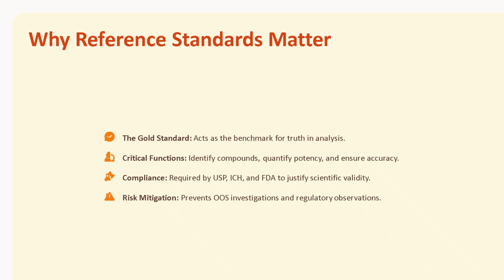More importantly, regulatory bodies like USP, ICH, and FDA expect proper justification for the standards we use. Choosing the wrong reference standard can lead to serious consequences, such as out-of-specification results, investigation, and even regulatory observations. So, reference standards are not just materials. They are the foundation of reliable analysis.